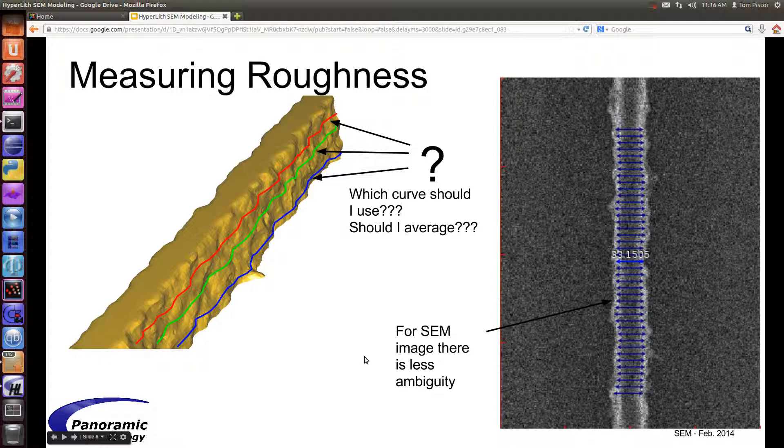When you measure roughness, there's always an issue about where to measure the resist profile. Should I measure at the top, at the bottom? Should I average this out? But when you measure roughness on a SEM image, it's a little bit more clear.